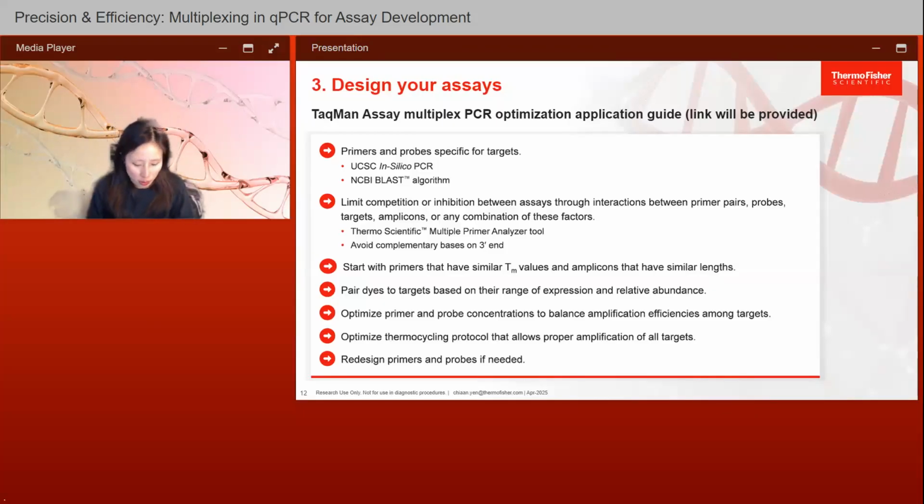There's a general rule also on having your primer pair within 5 degrees of each other, having your probe sequence Tm about 10 degrees higher, and also things like avoiding repeats, and having a good balance of ATGC in the region that you pick for your oligo. As well as avoiding primer dimer pairs and hairpin structures.